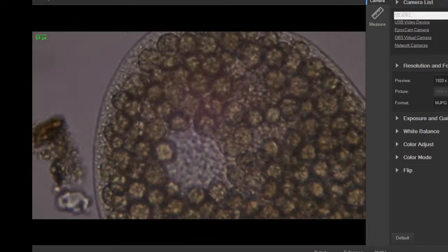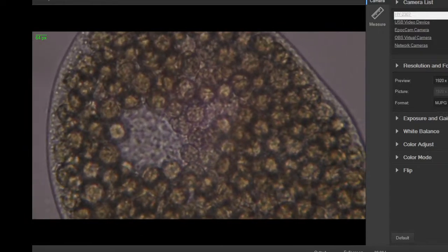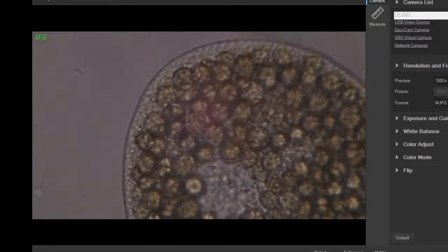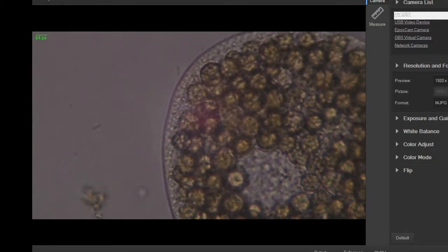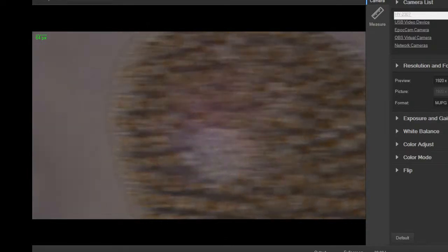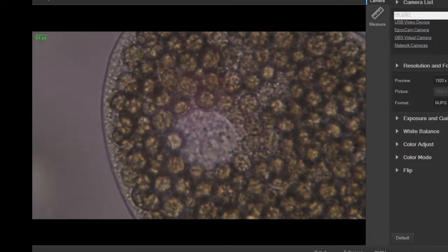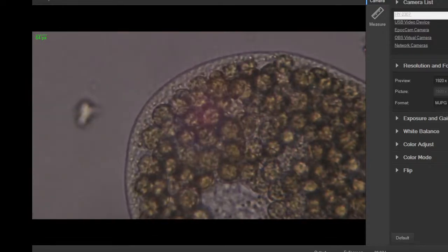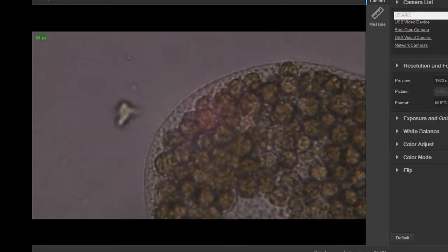Yeah, this is a nice specimen. This might be blepharisma. Let's look this one up. You see it's kicking stuff all around it. As all the cilia hit things, it's batting everything aside. And when it's swimming harder, like something like a rotifer will do, you'll actually see currents from it forcing stuff floating around in different directions.